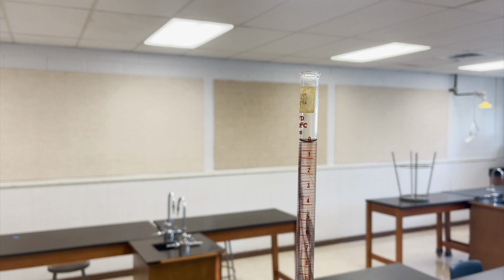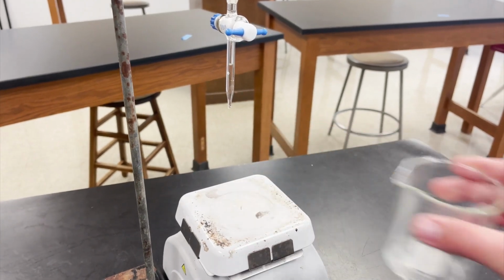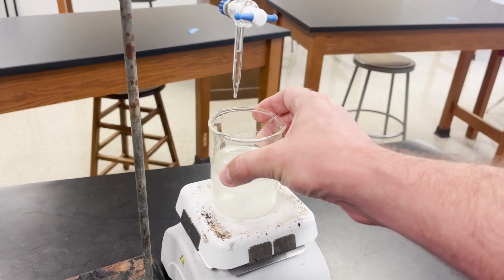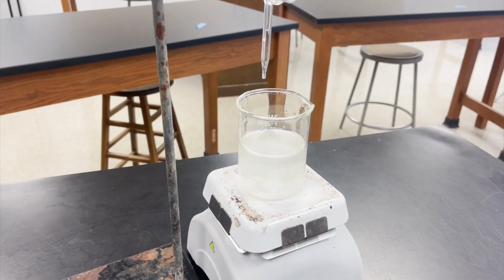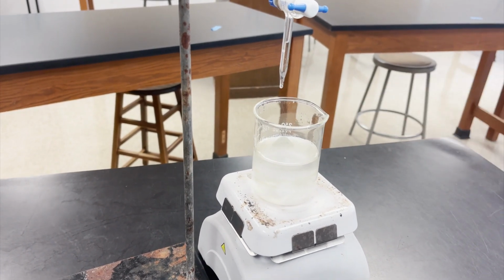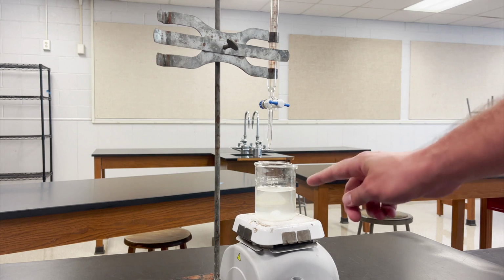Now, what we're gonna end up doing is, first off, this is our extra beaker that we use to bring it down to 0. Now what we're going to do is put this beaker with the aspirin inside of it on here, and we're going to add enough sodium hydroxide in there to neutralize all of the aspirin. So again, there is aspirin in here.